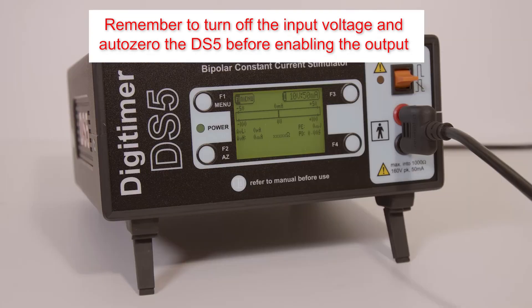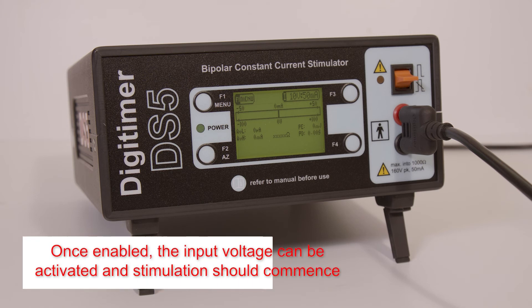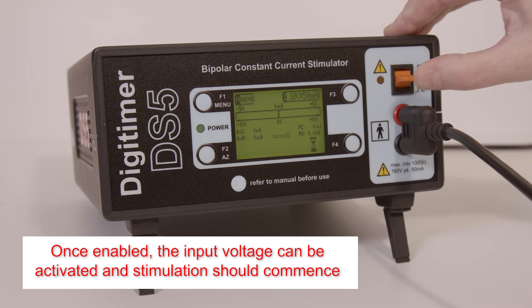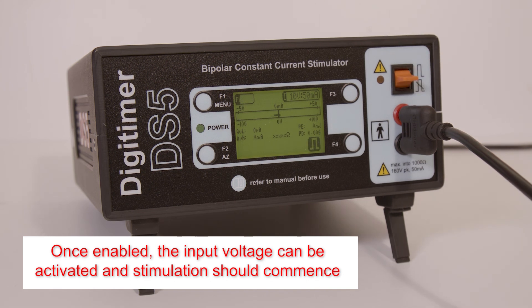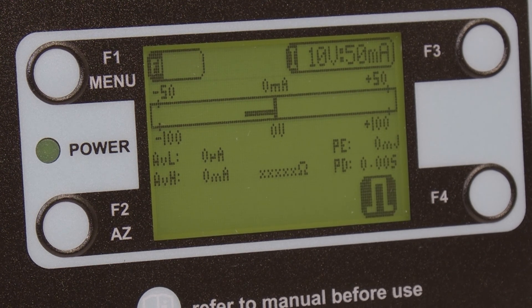Importantly, this procedure has to occur while the input voltage signal is at zero volts, in order that a baseline voltage level can be determined. Once auto-zeroed, the flashing icon disappears and the output can be enabled using the orange toggle switch. Success is confirmed by the output-enabled icon in the bottom right of the display, and stimulation may now commence.